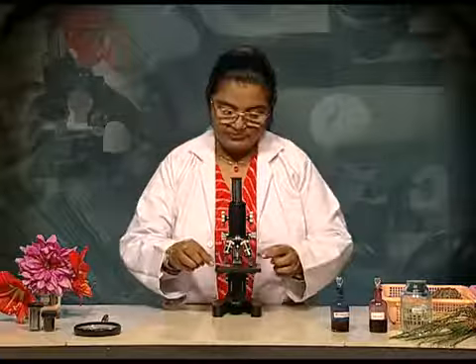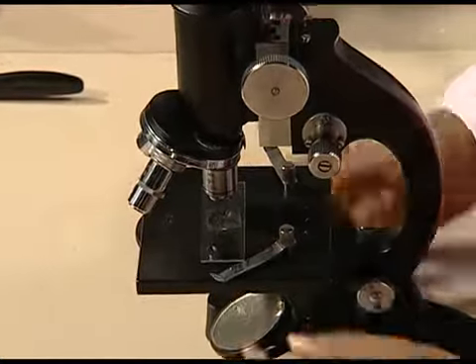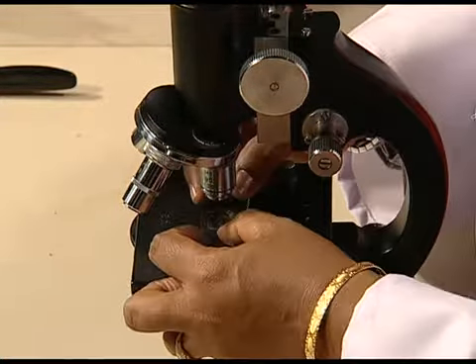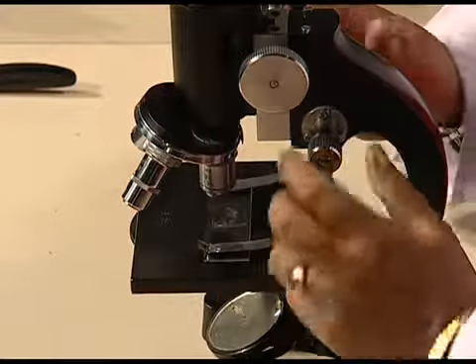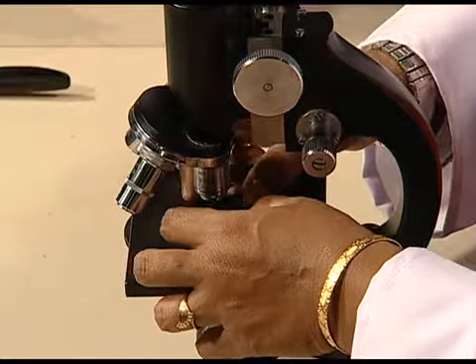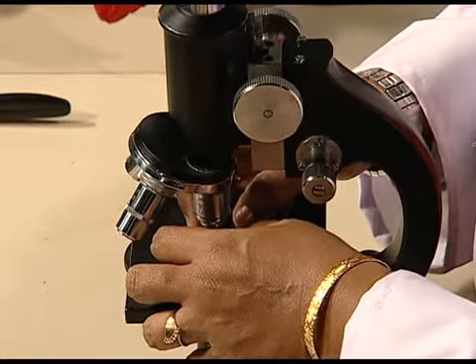Place the slide on the stage right above the hole. Clip it in place with the help of clips. After that, make sure that the slide object is right above the hole.